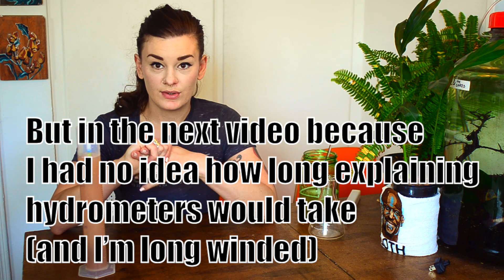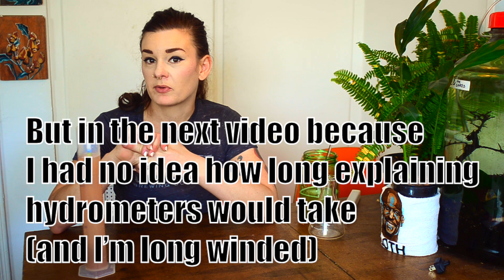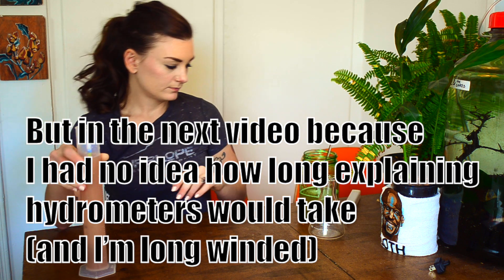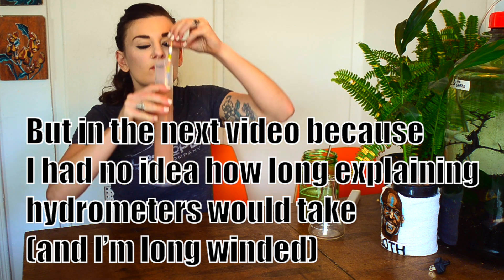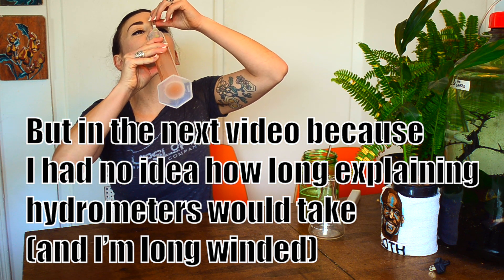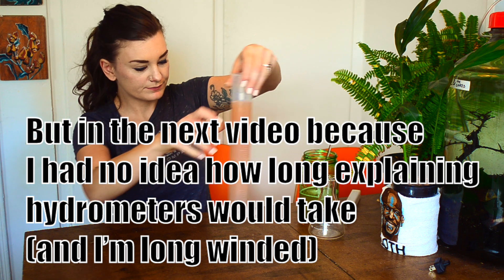Now that we've figured out how to use a hydrometer, I'm going to show you how to use a refractometer and how to calibrate a refractometer.